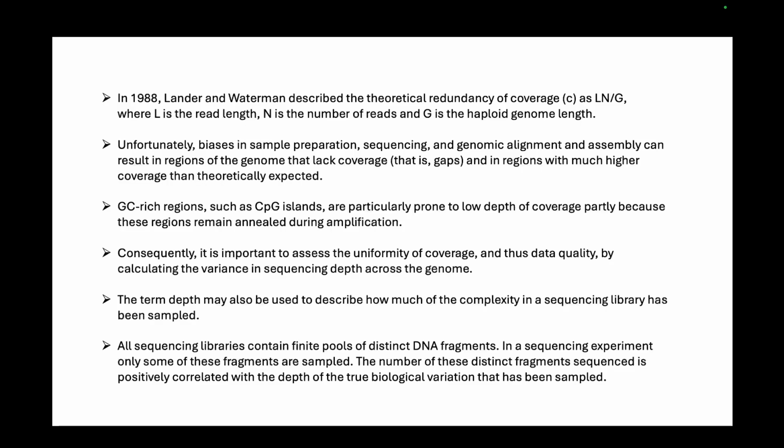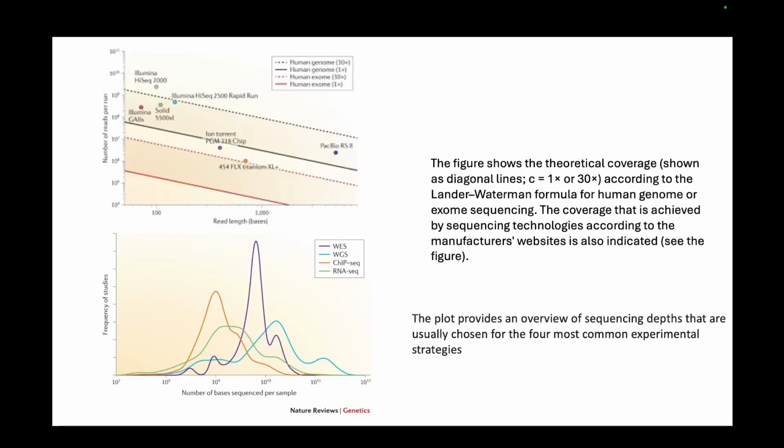But you need to have the intuition to identify the difference, which is coming from a sequencing error and which is coming because actually a variant is present in there. So we'll cover this going on, but I just want to give you an idea. So yeah, we've covered mostly everything in terms of depth and coverage. So I just wanted to give you an idea about how different coverages look.